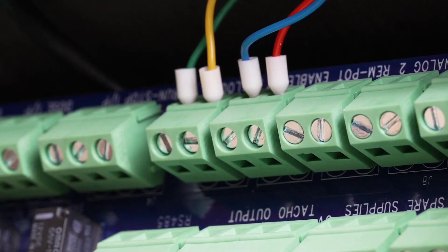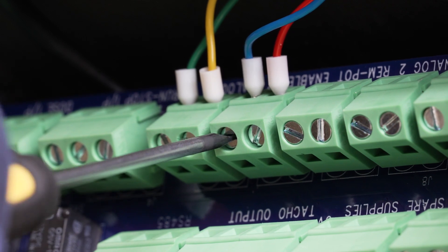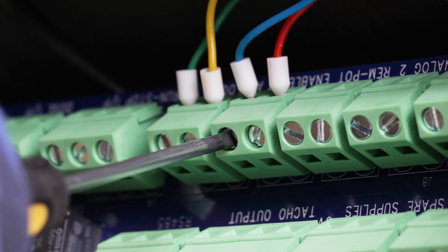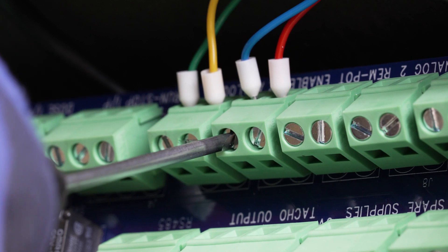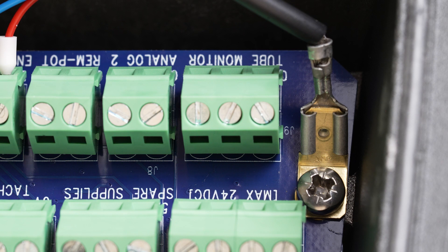For this example we're wiring in the analog function and run/stop function. Insert the cores into the relevant I/O board terminals. Using your terminal screwdriver, tighten the terminal screws up against the inserted cores.